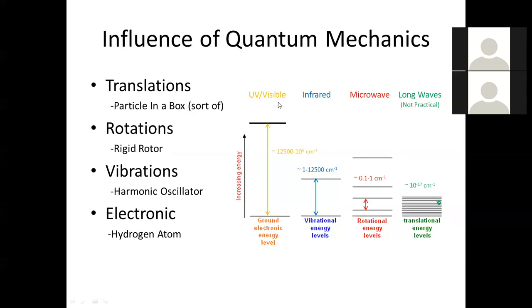And we learned that different kinds of light from the electromagnetic spectrum can be used to probe these different states of molecules, right? So when we use UV visible, we're usually talking about gaps in a molecule's electronic states, so we're actually exciting the electrons to a higher molecular orbital. When we talk about infrared, we're talking about vibrations along a bond. That's what we're exciting, like rocking or wagging or stretching or bending motion along a bonding axis. So that's one way they can store energy. And those have smaller gaps, right? Similarly, microwaves are even smaller than that, and those are rotations.